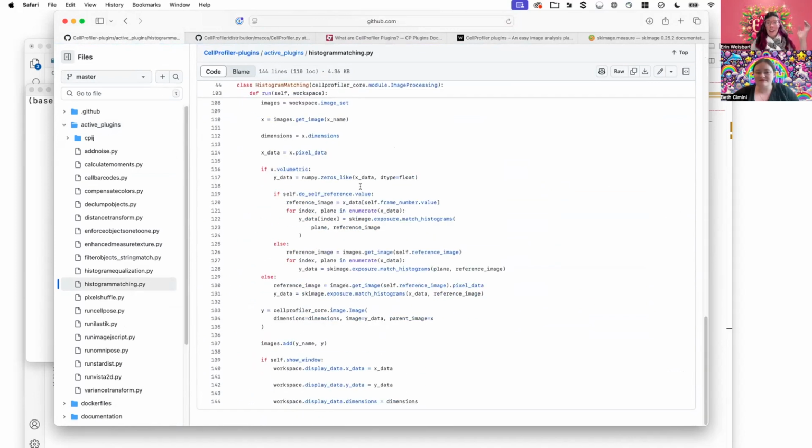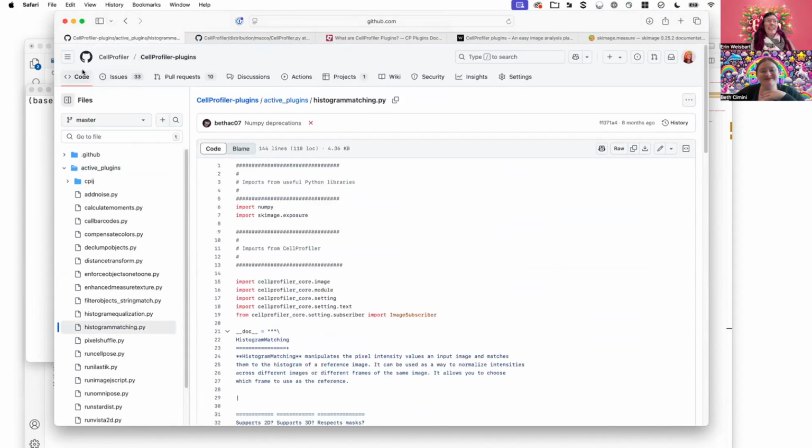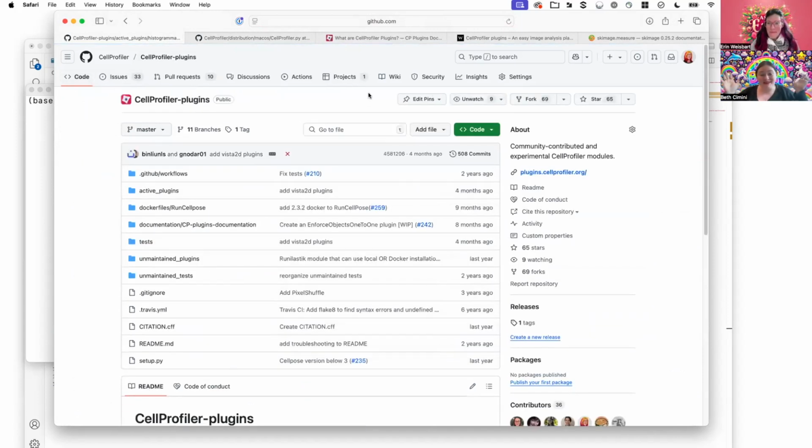But if you are not comfortable working with code, you might ask: what if I don't want to look at this code? If you don't want to look at this, you don't need to look at this. Yay! That's what I was hoping you were gonna say.